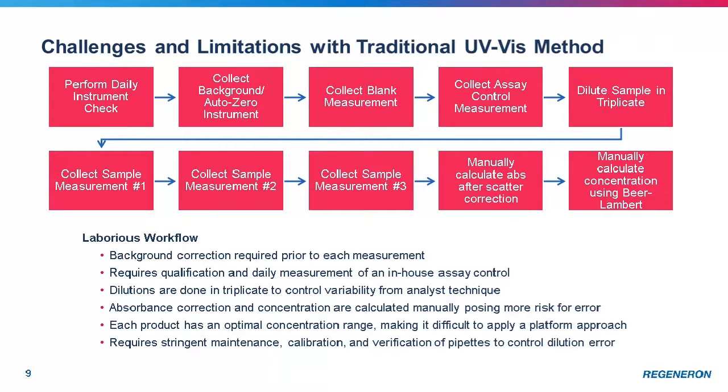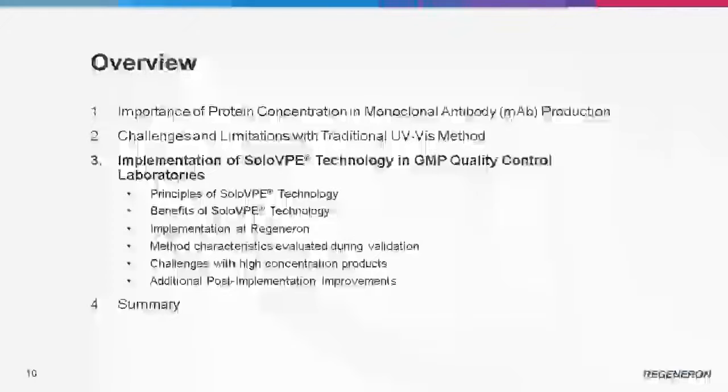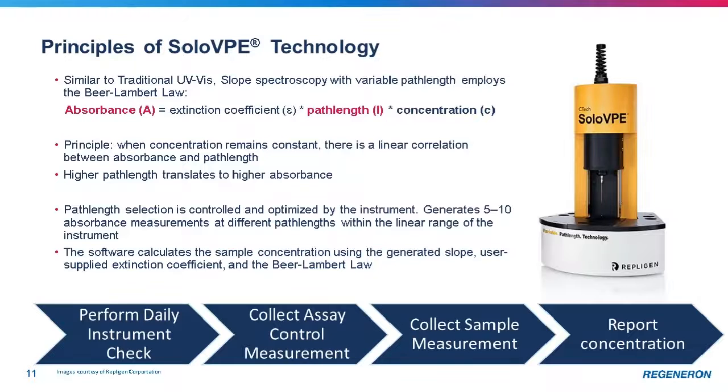Finally, the optimal concentration ranges are implemented for each product based on the extinction coefficient of the product. This makes it very difficult to apply and implement a platform approach of total protein measurement within the QC lab. So given some of the limitations discussed with the traditional method, next we'll overview some benefits and challenges experienced with the implementation of the SoloVPE technology.